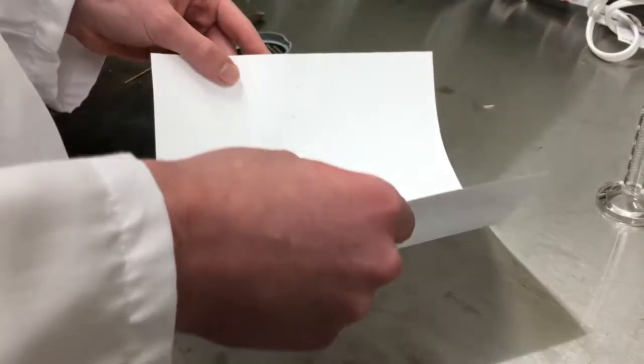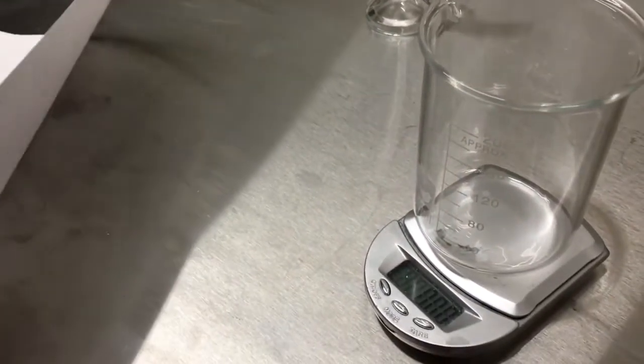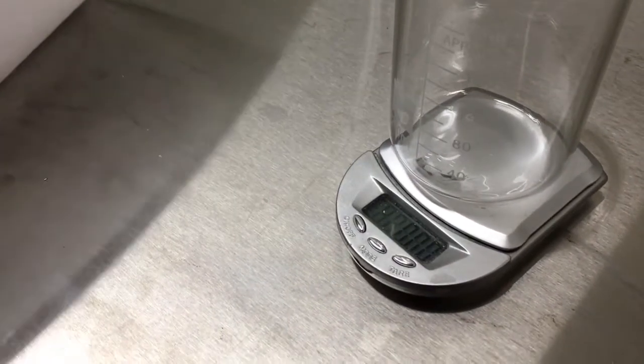So at this time, the amount of silver shavings I had looked good, so I decided to weigh it out into a beaker and it weighed perfectly 2 grams.